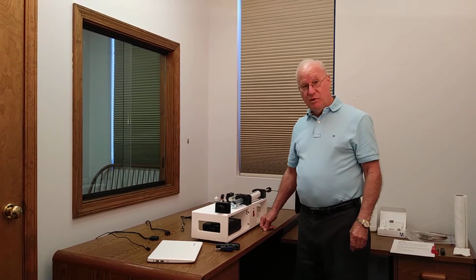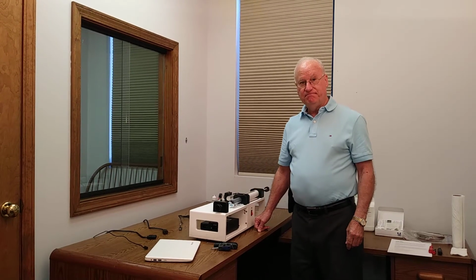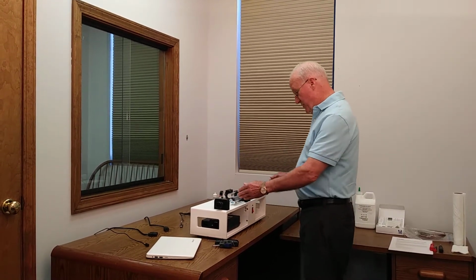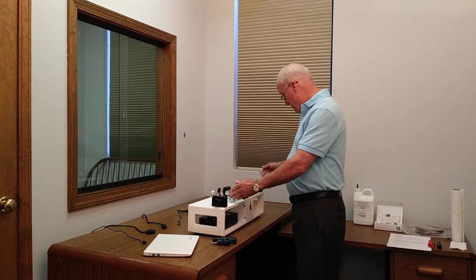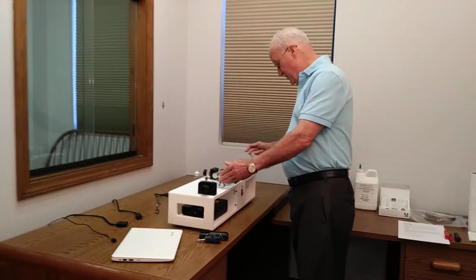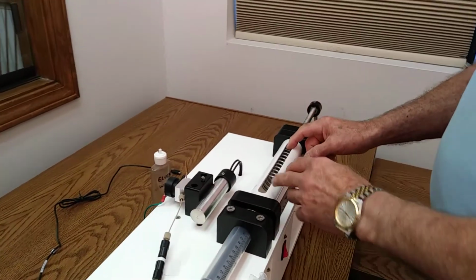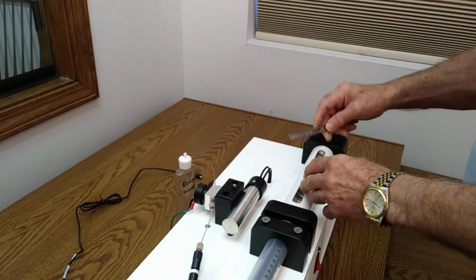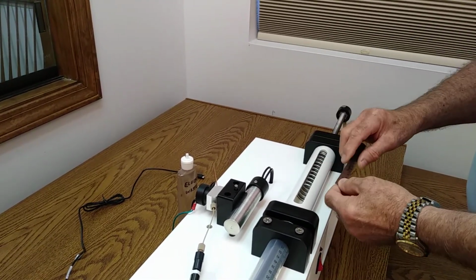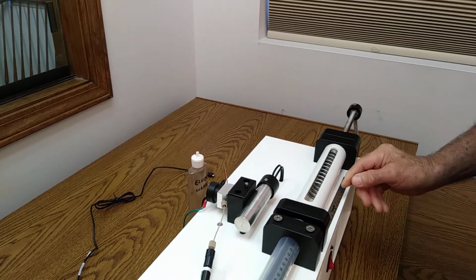Begin by a walk through what the components are, what tools you need to use with it, and how to put it together. So to begin with, we have a pump located here, which consists of a stainless steel bolt, which is used to compress a spring. We measure the compression of the spring by the distance between two bearings, which we will go through when we get to the point of filling the syringe.